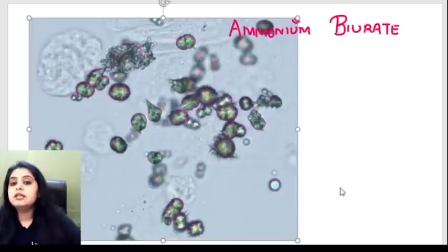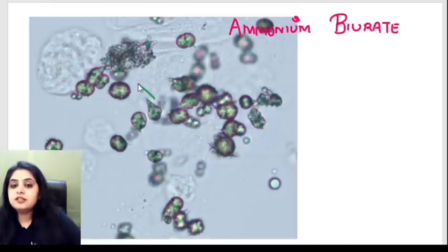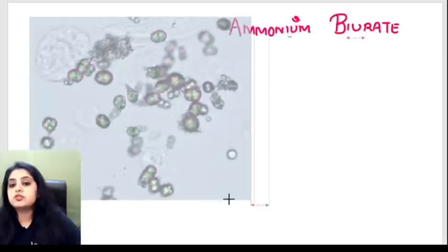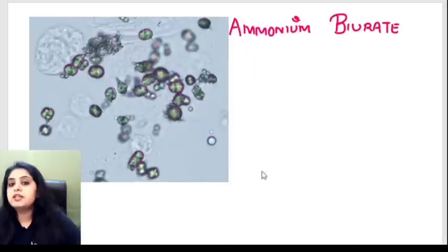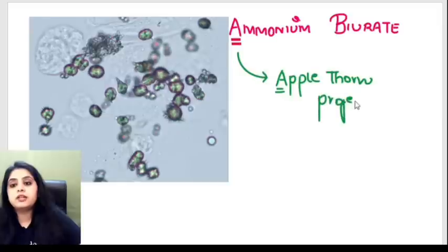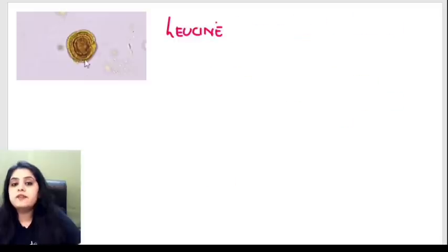Moving on, here we have crystals showing classical thorn-like projections. These thorn-like projections are known as apple-thorn projections. 'A' for apple-thorn projections means ammonium biurate crystals. So apple-thorn projections equal ammonium biurate crystals.